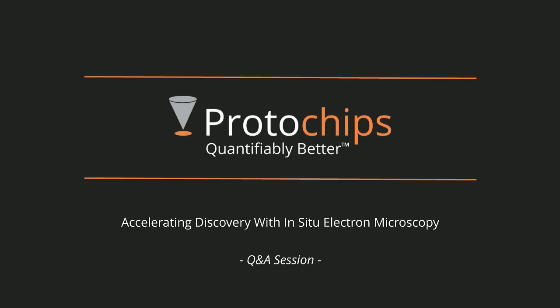So it's a little slow process, but again, there's a trade-off between the spatial resolution that you want to get and the temporal resolution that you hope to have to see some dynamic transformation. It is inherently slow as compared to other TEM techniques, for example TEM imaging using fast detectors or dynamic TEM.